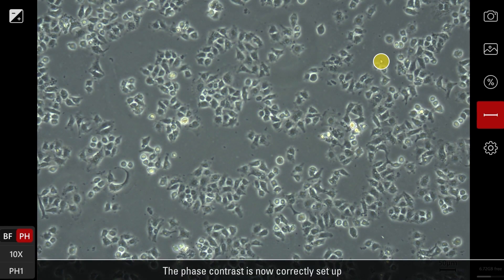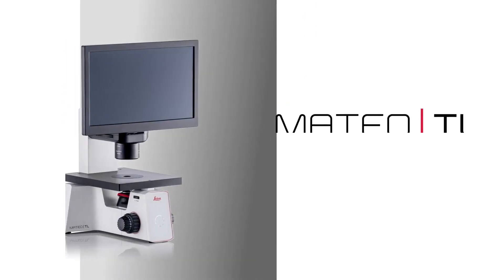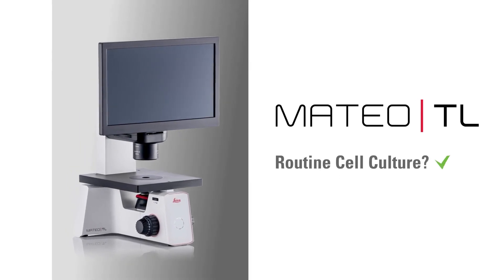The phase contrast is now correctly set up. Mateo TL. Routine cell culture? Check.